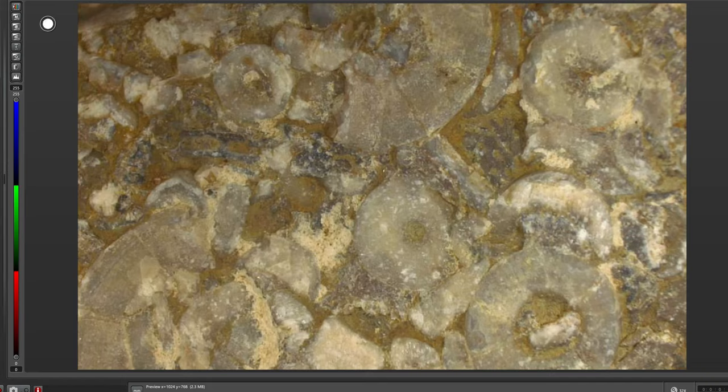Doing something a little different today. We're going to look at some stuff on the stereomicroscope, so we're going to take a little walk on the light side for a change. Instead of using electrons to see, we're going to do a day where we look at random other things.